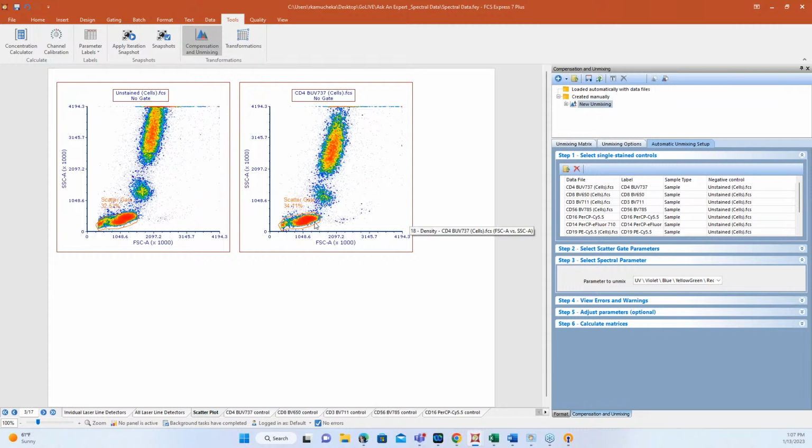Yep, exactly. And same with mixed media, right? We can use a data specific gate so that we're not creating a second scatter gate. We're just moving it to a more appropriate place if we're working with mixed media. And sometimes even in this experiment specifically, we have different cell types. So I can't just use a single scatter gate, because other times it's not appropriate to see the fluorescence that I'm looking for on the cells because it's not the right cell population. So you have that flexibility, that customization that you can do.